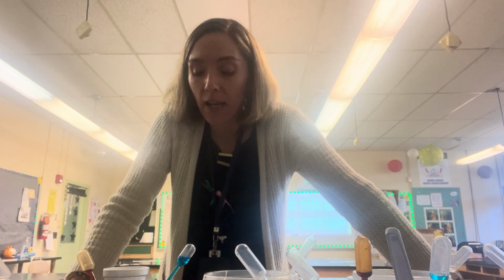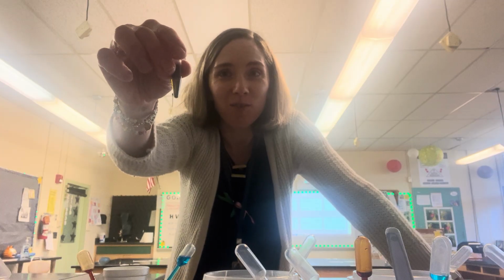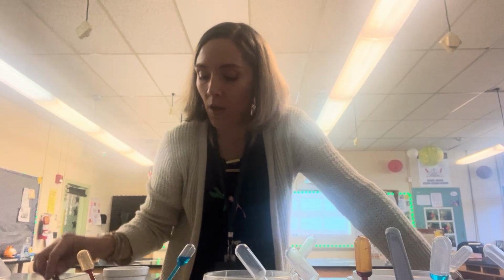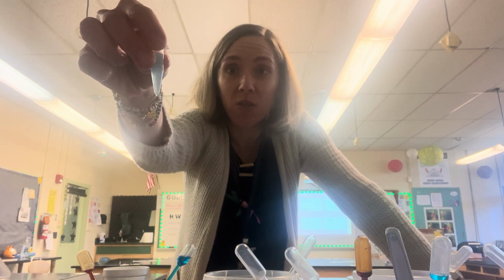Remember, A and B was liquid that just had the food in it. We took A and tested it with iodine to see if there was starch, and we found it turned black. The iodine detected the presence of starch in the food molecules without any amylase. So food on its own turned black means that there's starch in it. Then we tested tube B, which was food by itself, with Benedict solution to look for glucose. Put it in the hot water, and we got this, blue, no glucose. So the food on its own has no glucose in it.